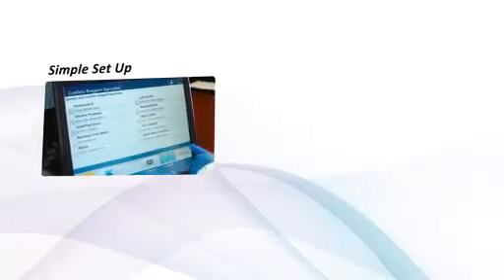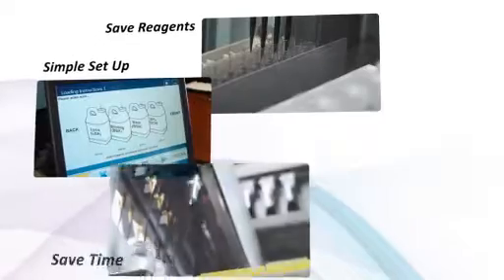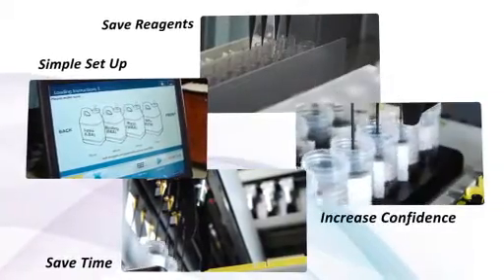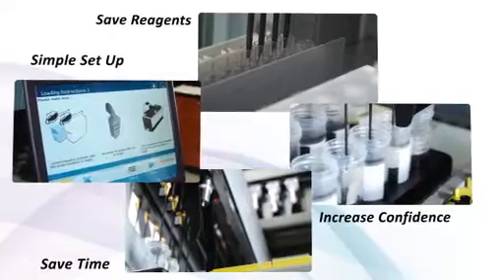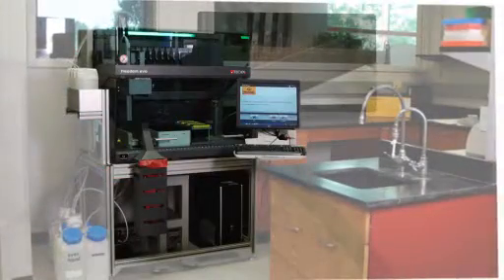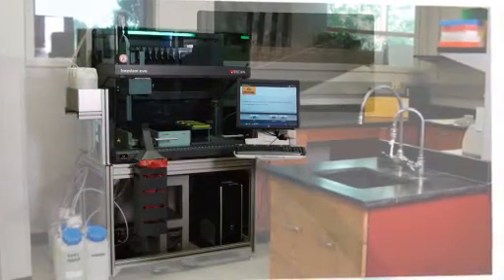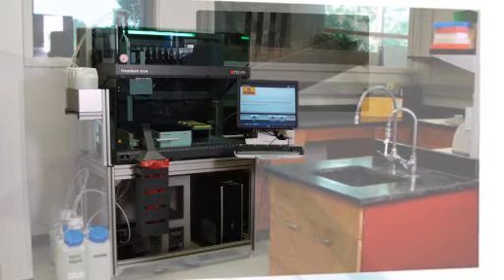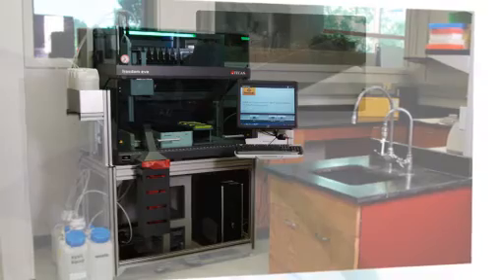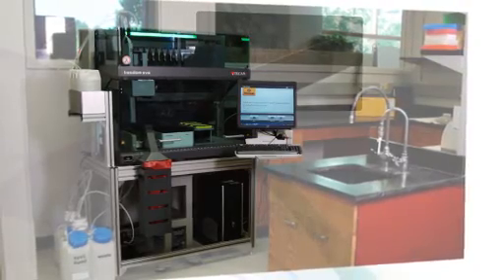Both during processing and staging of samples for purification, processing blood using the Promega ReliaPrep large-volume GDNA isolation system on the Tecan Freedom EVO HSM workstation provides an easy-to-use system for reliably extracting genomic DNA from large-volume samples.